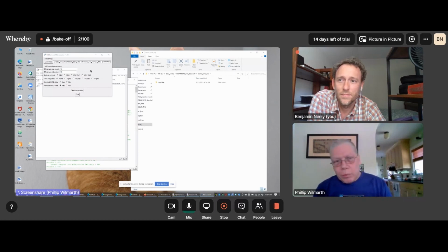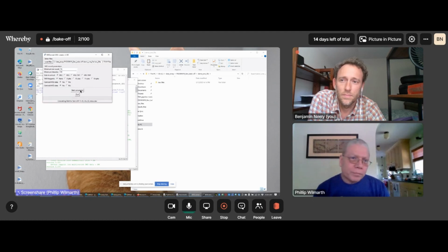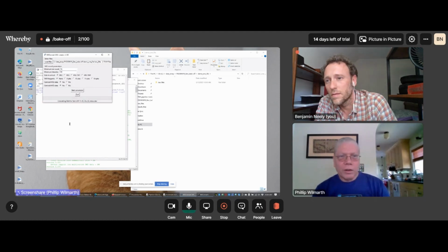The pipeline also has support for TMT labeling, which is what most of the radio buttons and things are here for. We're basically just going to make our MS2 scan data so we can identify the peptides, and we can usually live with centroided data with Thermo instruments without any problem. So most of the defaults here are just fine for this. So once we've got the raw file loaded, we can just hit start conversion. And it's going to start going.